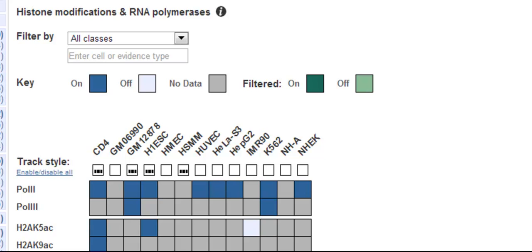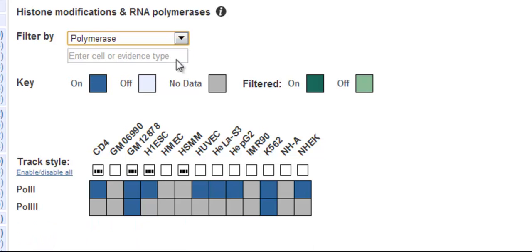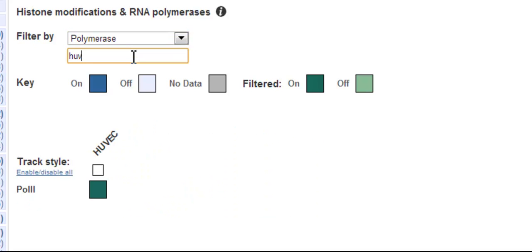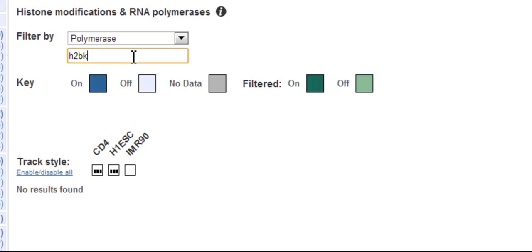If you're only interested in polymerases, for example, you can choose them in the filters. This simplifies the matrix. You can even type in one cell type if you don't want to see the others, for example, HUVEC cells. Or type in a particular histone you're looking for. Maybe it starts with H2BK.